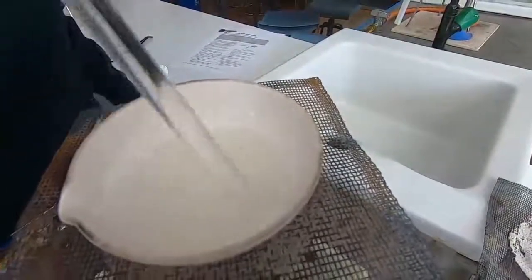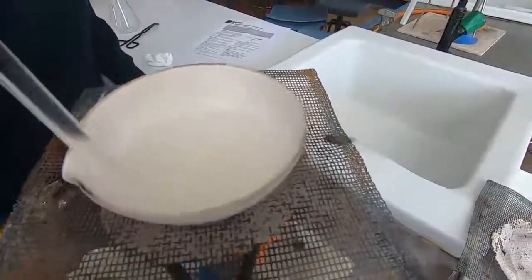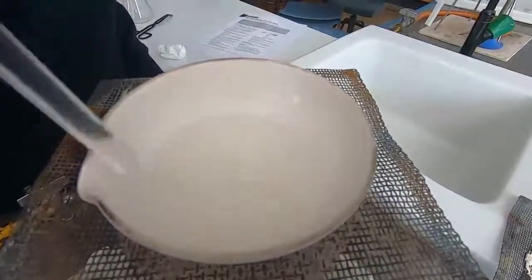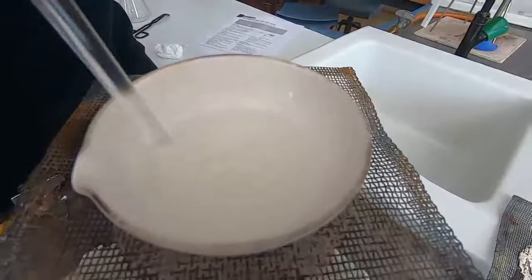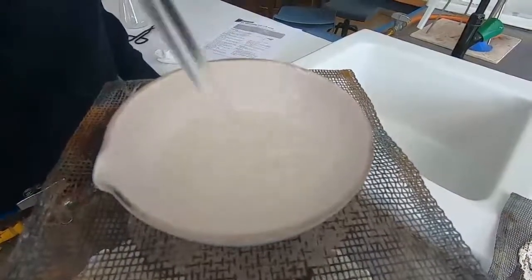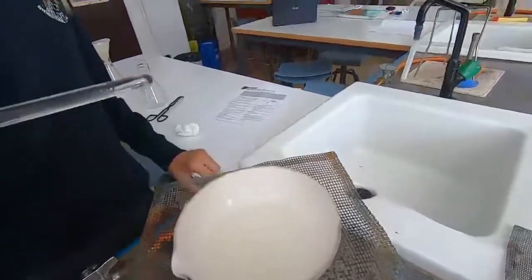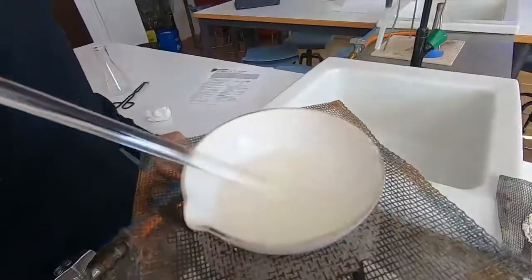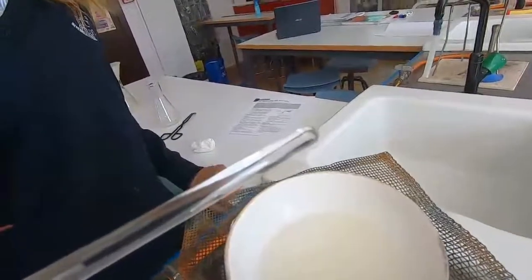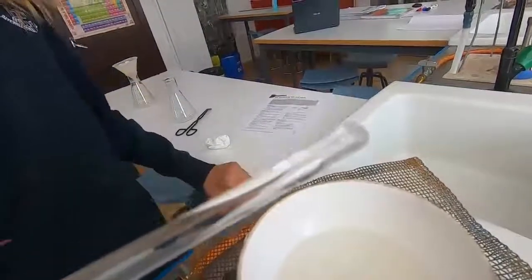A saturated solution is one that won't dissolve any more. We can test to see if it's ready to crystallize by just taking the wet glass rod out and having a look to see if there are crystals forming on the glass rod. Here's the glass rod — they weren't forming very quickly so we keep doing that, and eventually you'll get to a position where the crystals form quite quickly on the end of the glass rod — it sort of frosts over.